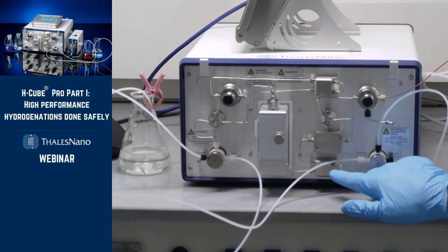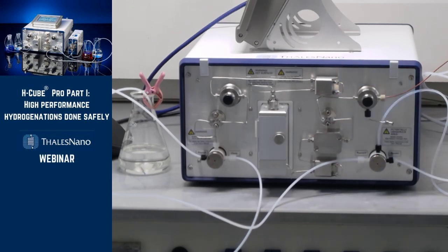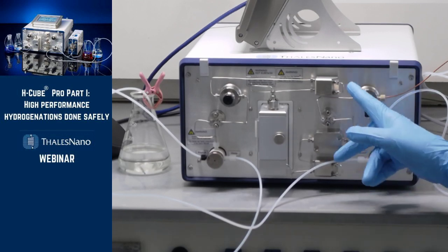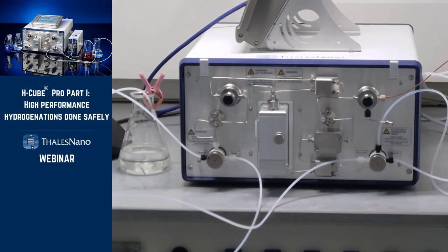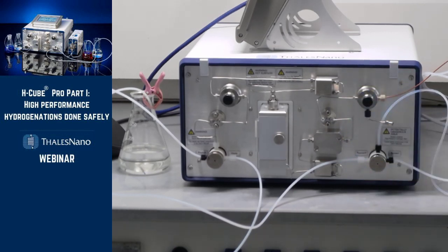From there, we go into this connection block. We have two of these. These can be used to connect other devices to the H-Cube Pro. Such a device is the Phoenix Flow Reactor. If you connect the Phoenix Flow Reactor using the tubing here and here, you can not only physically connect the tubing, but you can also connect the Phoenix to the H-Cube Pro software, and then you can control the instrument from the H-Cube Pro. We will focus on that later on in our upcoming webinars.